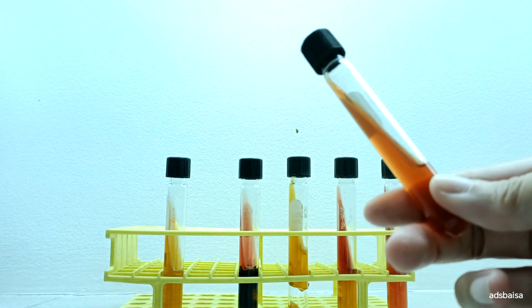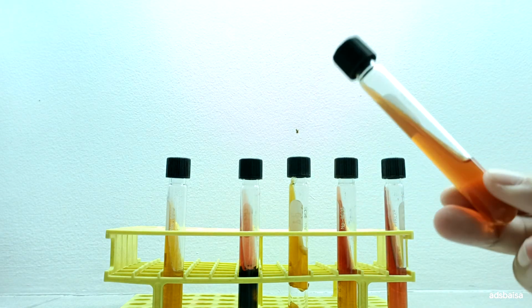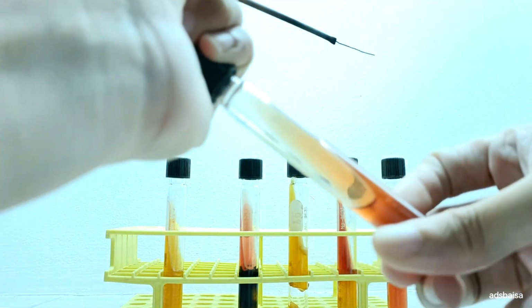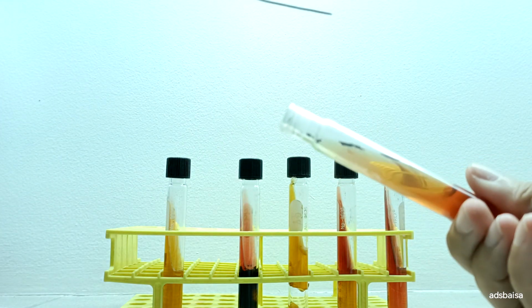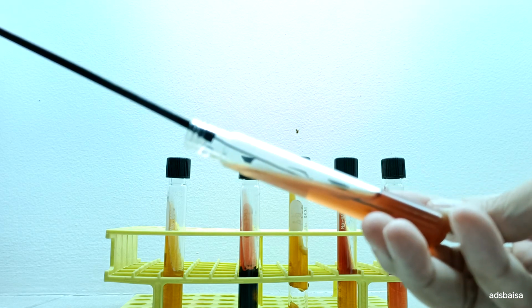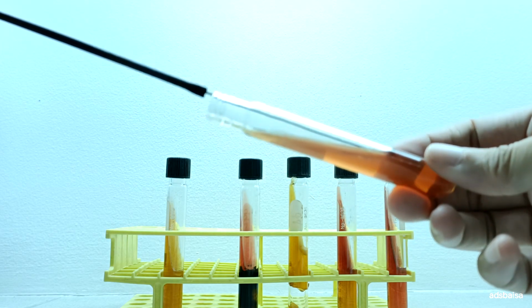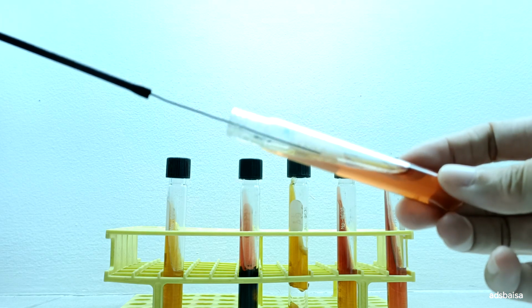So you have to get your bacteria from your culture using an inoculating needle, and then what we have to do is to stab the agar deep straight. So this one, stab the agar, and then using a zigzag pattern, streak the surface of the slant. This one.